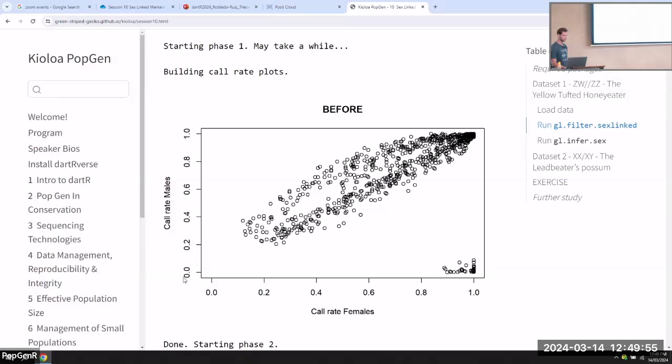The next thing the function does is look at heterozygosity of the individuals. Same thing. First we're going to look at the Z-linked markers, which are heterozygous in males because they have two Z chromosomes. Some individuals will be homozygous, but if there's polymorphism on the site you're looking at, on the SNP, then there's potential to be heterozygous, but usually only up to 50%, because that's what you expect under Hardy-Weinberg equilibrium if you're looking at individuals within one population.